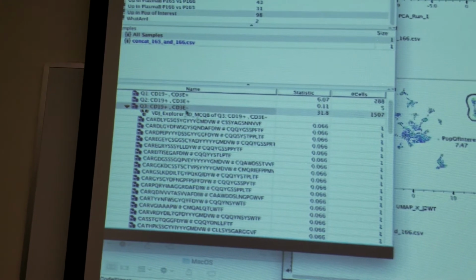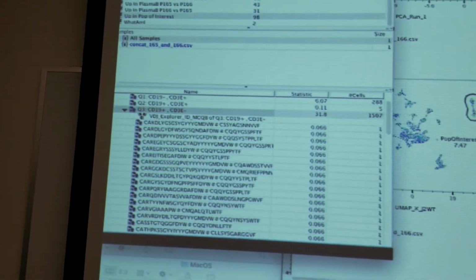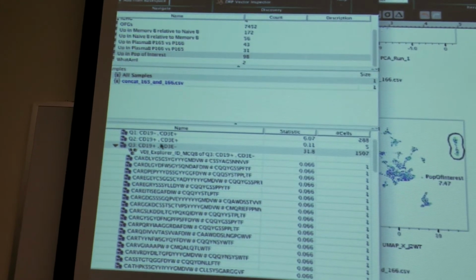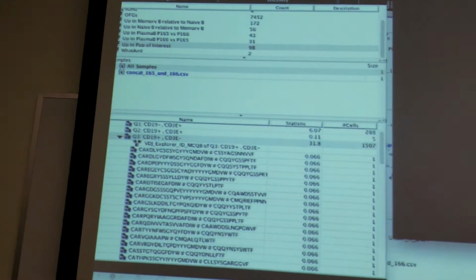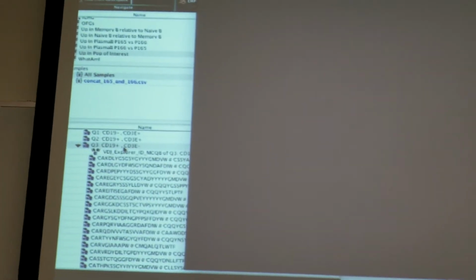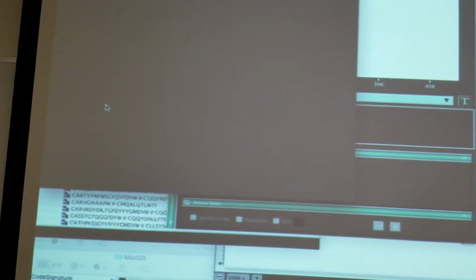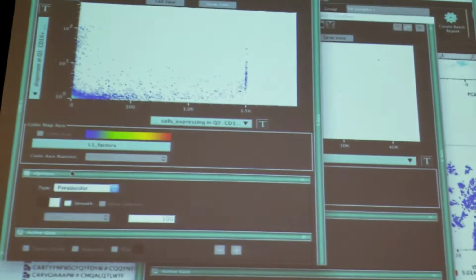It's definitely going to be our recommendation that you go back through the quality control. Okay, all right. So, for example, here's CD19 positive. What we were thinking are probably the B cells, or not. You guys are totally on top of it: you have dropout events that remove some potential B cells, and on top of that, you have the opposite occurring as well, right?